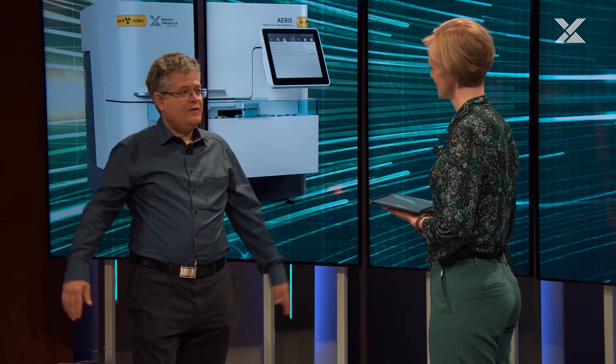That's the story of powder X-ray diffraction. How it works is very simple. You have your sample on a rotating tray and you have on one side an X-ray source and a detector and you make a V-shaped movement. You collect a pattern and that is mostly a very flat pattern with spikes. When you have a huge database, typically about a million compounds, much larger than many other databases, that's the power of powder diffraction really. You right away find what you have got and how much of different things you have got.